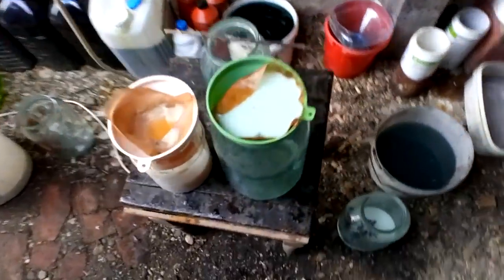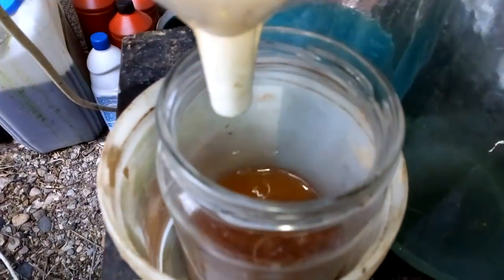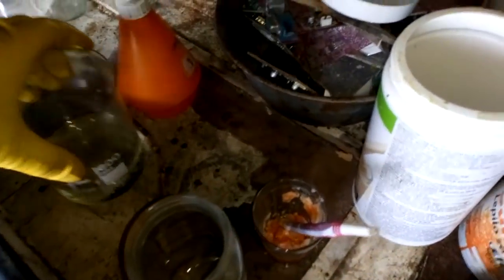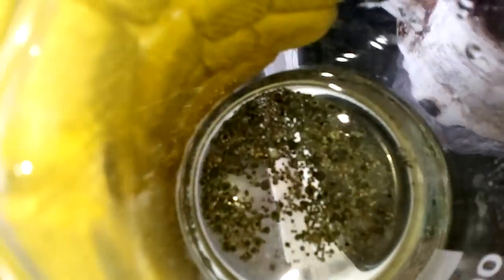Now I start to filter all that yellow solution from the aqua regia. But after one hour of boiling I still have residue. I put that on strong heat, 60 degrees.